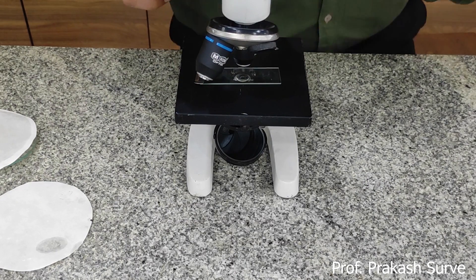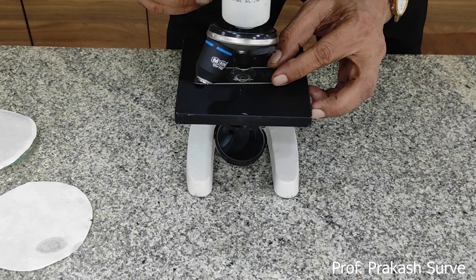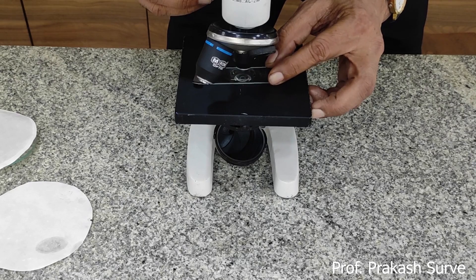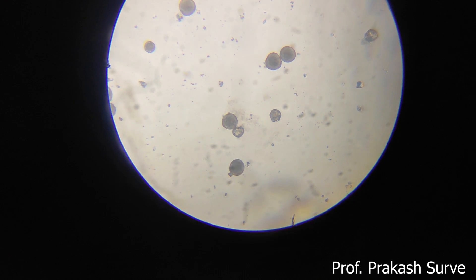This will be observed under a compound microscope under 10x power. Hold the slide properly with the help of the clip, adjust the distance between the slide and the objective lens — first get the rough adjustment, then use the fine adjustment to get a clear view of the pollen grain. Now look through the eyepiece.